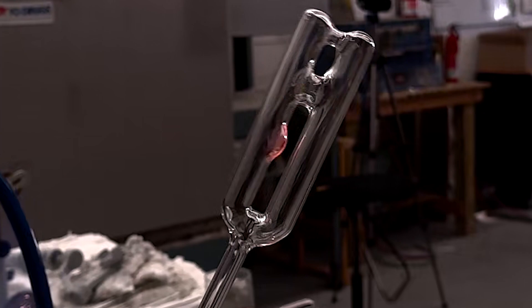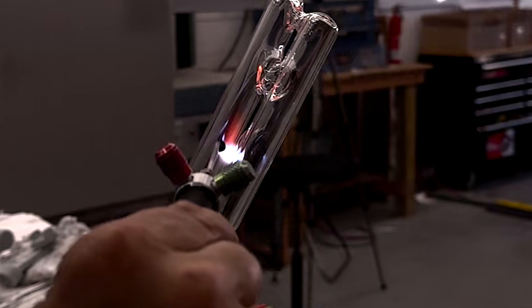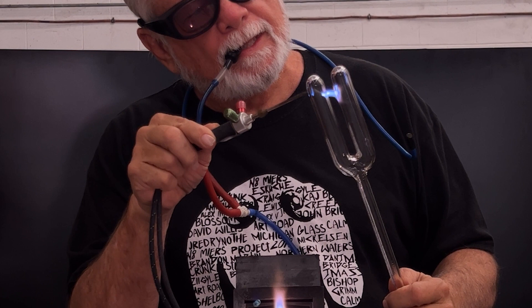It's better to be a little too far apart than a little too close together. This is because it's easier to add glass to a seal that is too thin than to remove glass from a seal that is too thick. The tools you will need are a good hand torch and a blow hose. A benchtop Bunsen burner is also very handy for keeping things hot while you work.